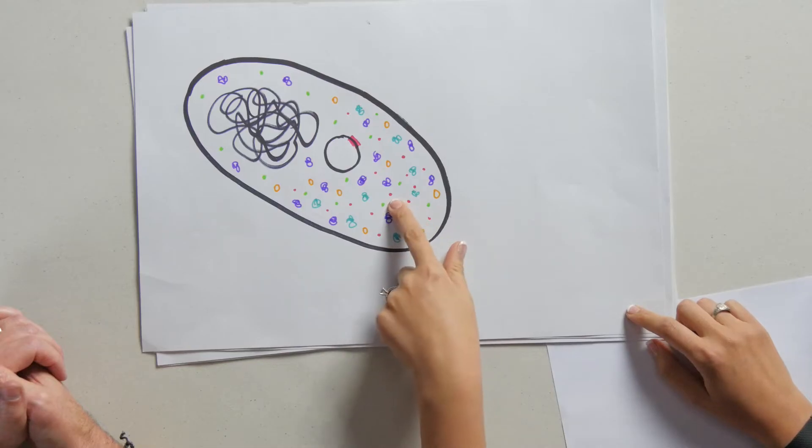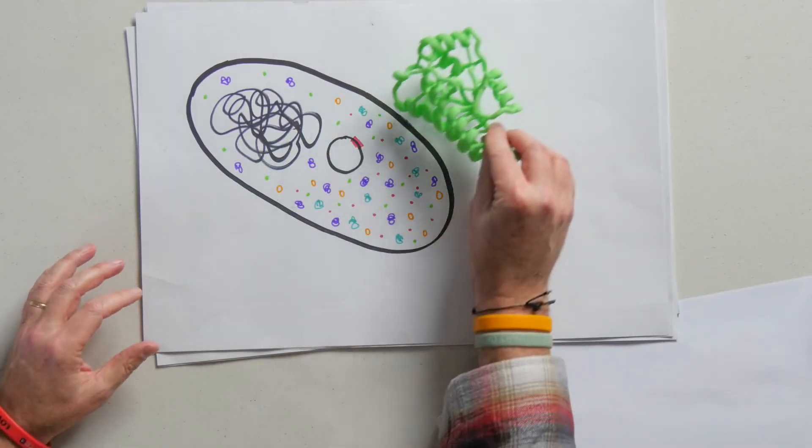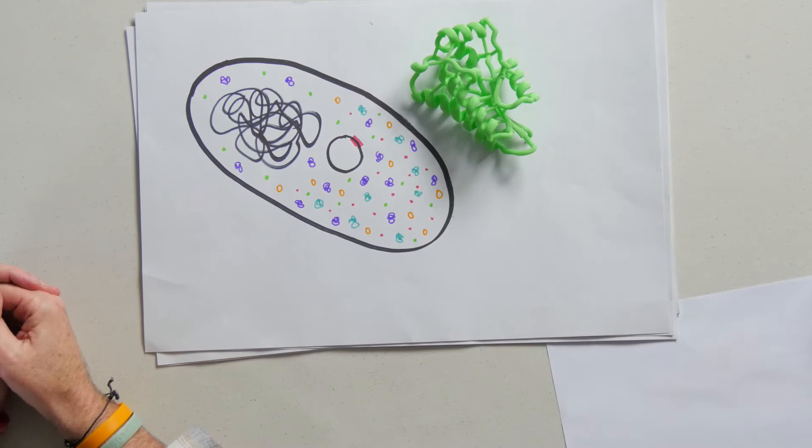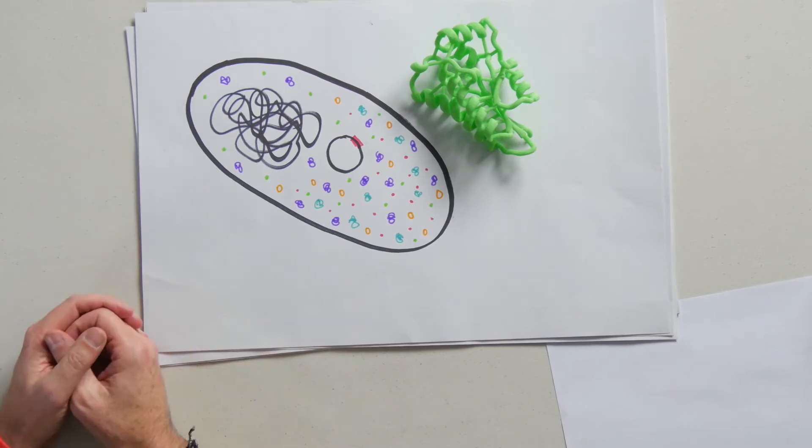And you can see there's a whole bunch of different proteins. So it's making the protein we want, the red one, but it's also making other stuff. And what I have here is a 3D printed model of a protein. And you can kind of see the complexity of the structure. And what we want to do is separate all the other proteins out until we get our red fluorescent protein.